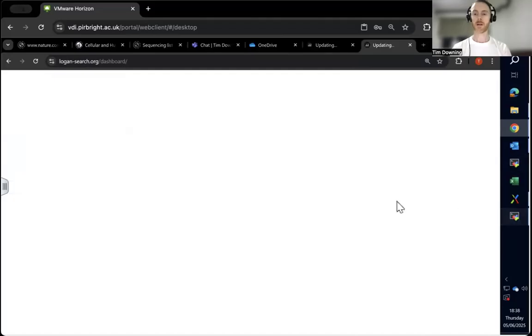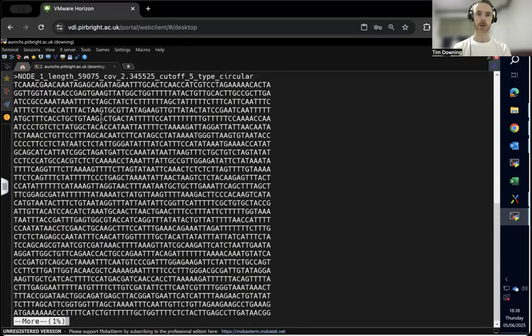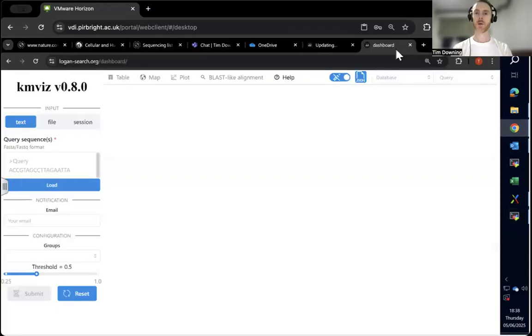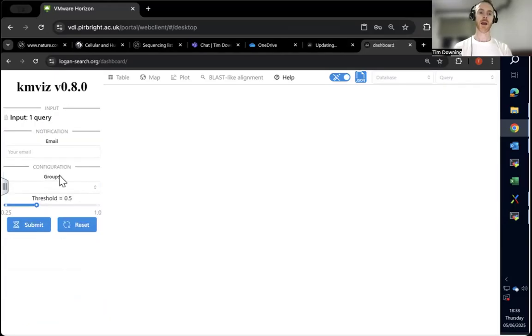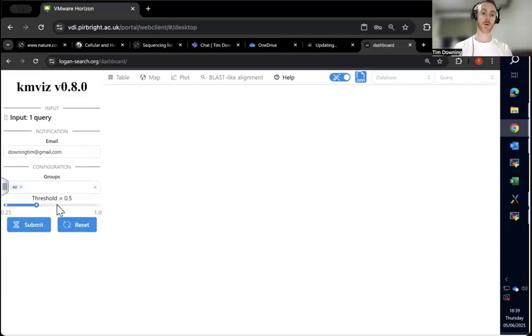And then we can do that as well for our metagenomic sample. So we're going to extract that as well in the same way, just using contig 1 initially, and we're just going to use that as a text query again. You can use more advanced approaches that are obviously not involving a website. However, they're cumbersome and won't fit into the time that we have available to achieve that. So this is merely to give you an idea of what you could do with that, and it's up to you to assess if it's useful for you or not.